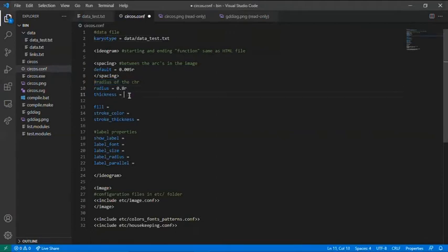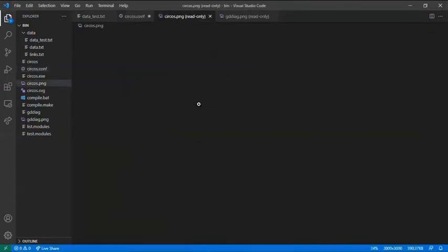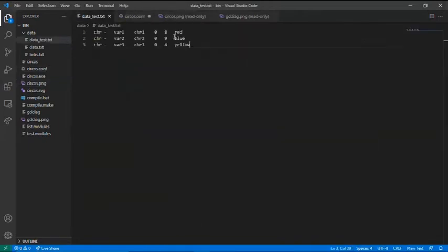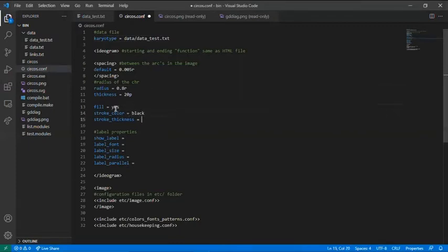And the thickness, I will put it 20 points. Now, if you want to fill the arcs with a specific color, you have to write here, yes. And the stroke color, I will put it in black with 0.2 points thickness.